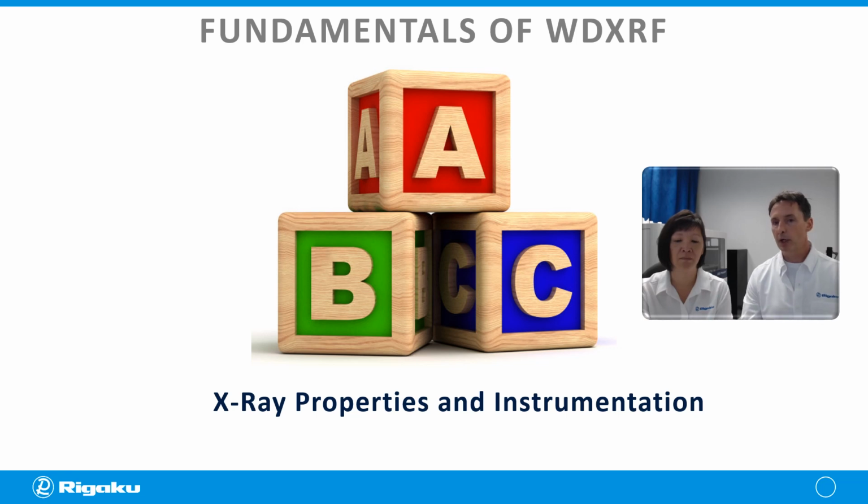So what we're going to do at this point is go through the fundamentals of X-ray fluorescence, just to give you a good basic understanding of what we're doing, and why we can do this as a direct analysis technique. And then after that, we're going to take you into the lab, and Thanh is going to show you different ways that we can prep pharmaceutical materials for analysis. But we're going to keep this really basic, high level, but if you want more in-depth discussion or conversation about XRF and particularly about your samples, we'd be glad to have a one-on-one session with you.